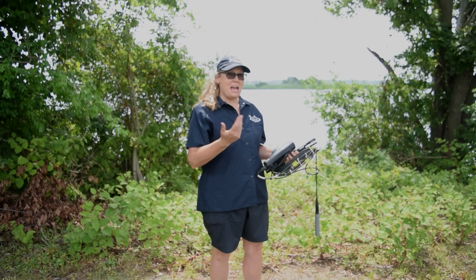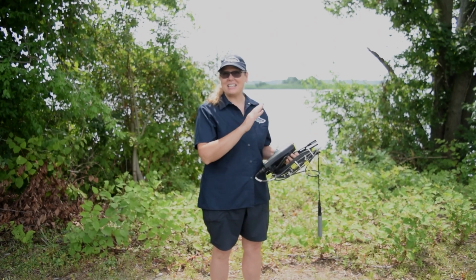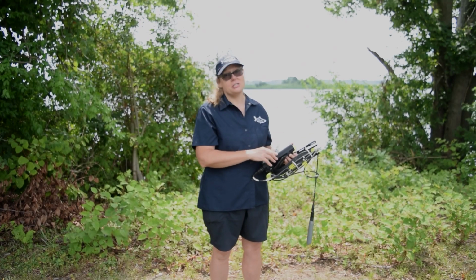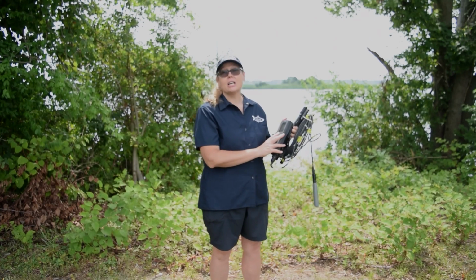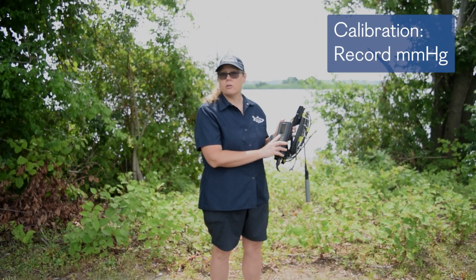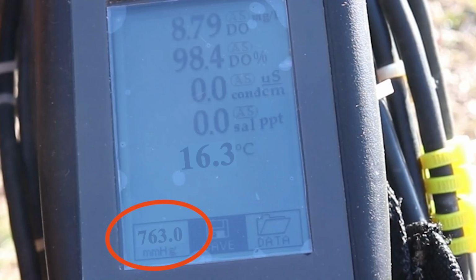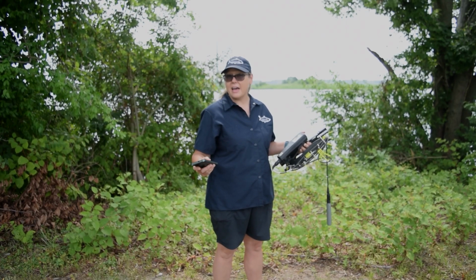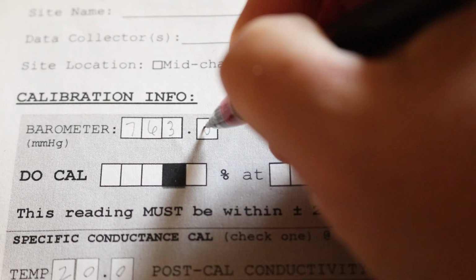All right, we're at our creek watching site and we need to make sure that we calibrate dissolved oxygen with our DO meter before we take our depth profile. So the first thing that we're going to do is look in the lower left hand corner to get our barometric pressure reading in millimeters of mercury. Today our barometric pressure reading is 763.0. We're going to record that on the front of our site sample data sheet in the calibration section.